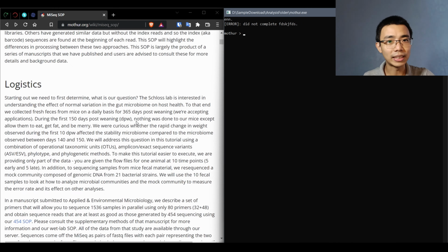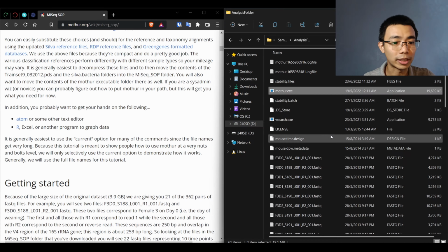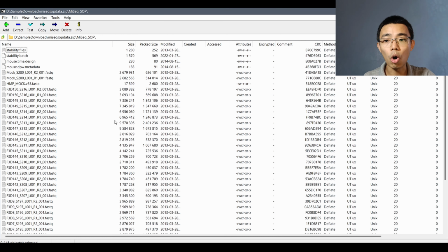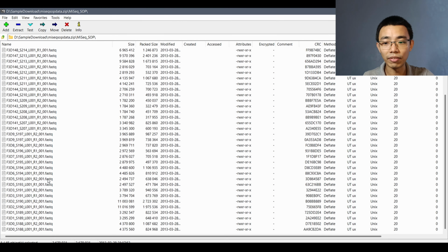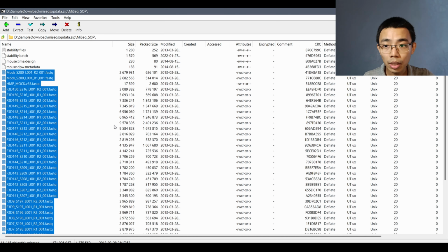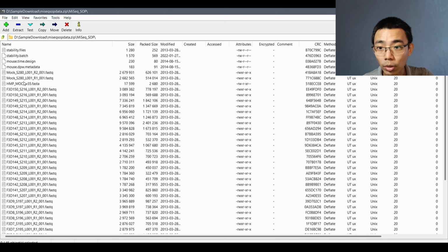First thing first is to inspect our sample data set. So let's go back to our folder just now. In our sample data set, you can see inside my SOP data, this contains all of our FASTQ files that we need from the samples, directly from the machine. We also have something called, where's my mock data? There should be something like mock data over here.